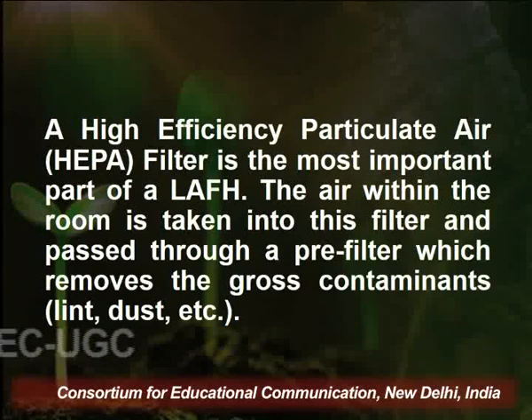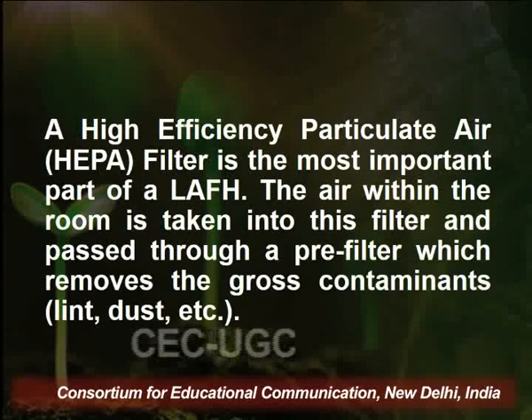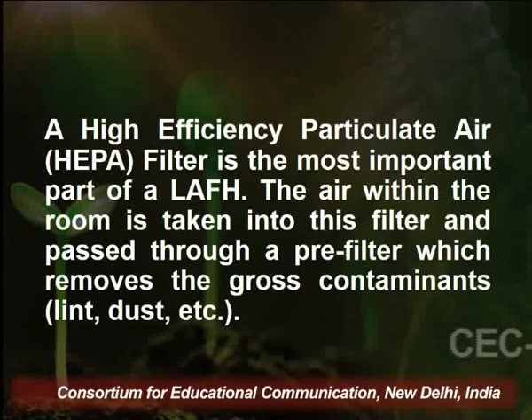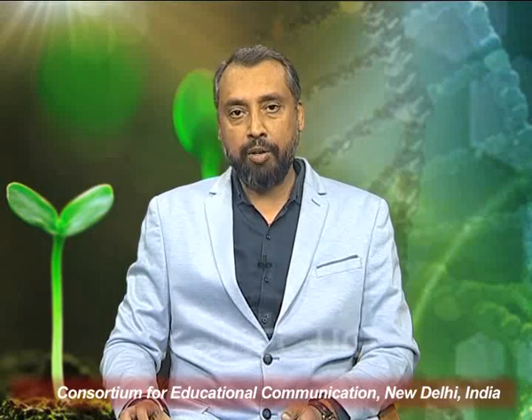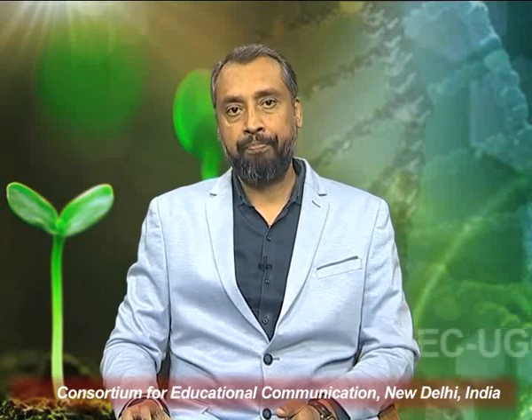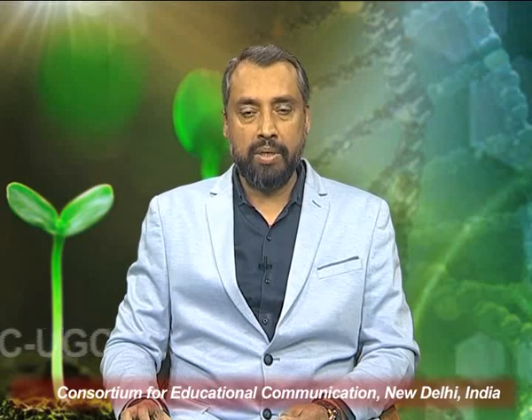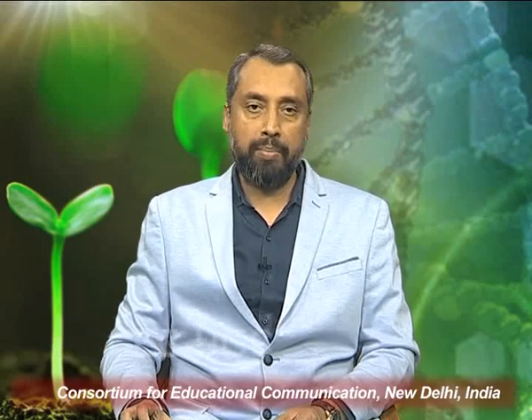The air within the room is taken into this filter and it is passed through a pre-filter which removes the gross contaminants such as lint or dust, etc. After passing through the pre-filter, the air is then blown at a uniform velocity through the hood and HEPA filter in a unidirectional manner over the critical sites, which is the immediate aseptic compounding area.